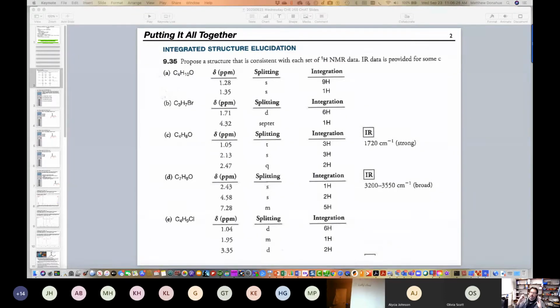And so really what this course will expose you to is, how can you think about this data and put it together so it makes sense and it doesn't violate something. If there is 0 degrees of unsaturation and there's 1 oxygen present, you cannot have a ring and you cannot have a carbonyl group. So you think to yourself, what functional groups remain that contain oxygen with no degrees of unsaturation? So Hannah says in the chat it's an OH group, so you can have an alcohol.